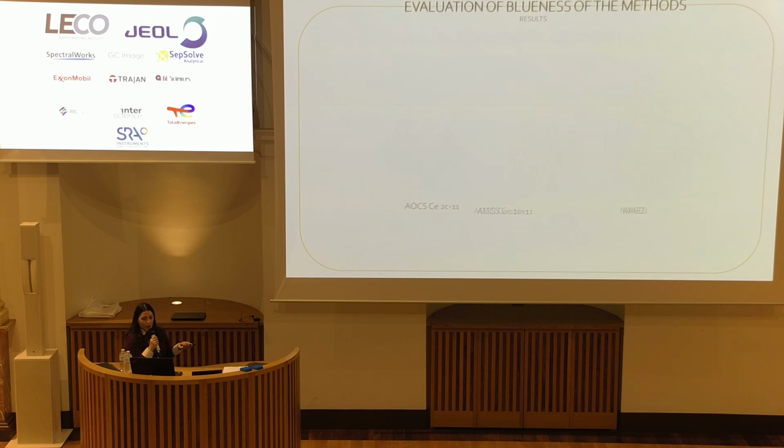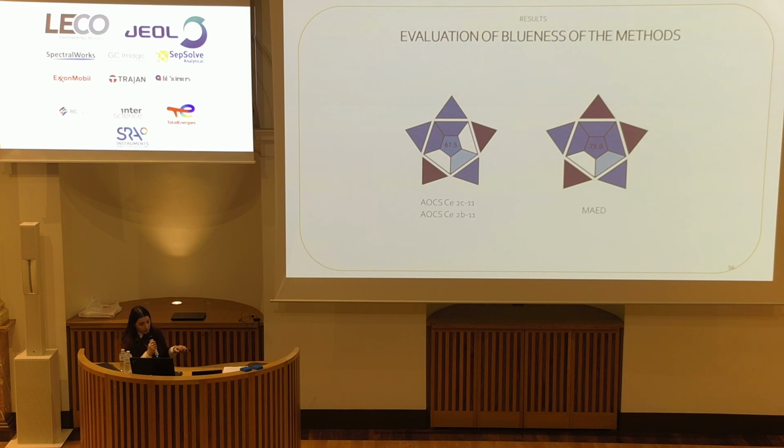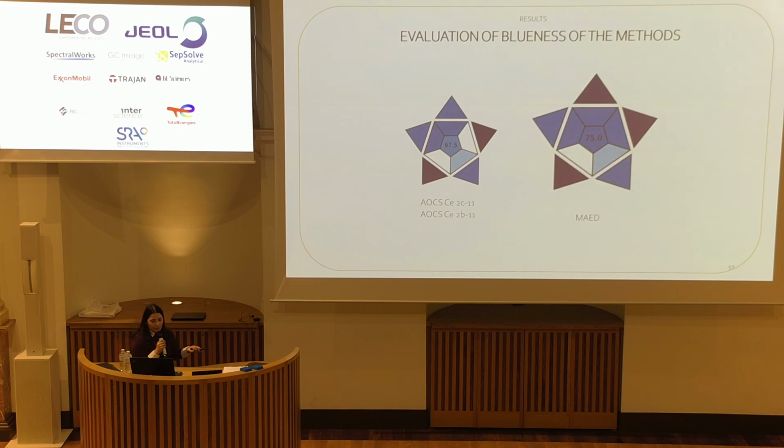We also evaluated the blueness of the methods with the metric BAGI, that is basically the evaluation of how practical your method is. All the methods are considered practical because they scored more than 60, that is the value to be considered practical, but also here the MAED has the highest score.